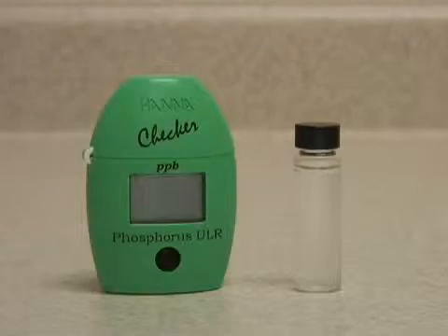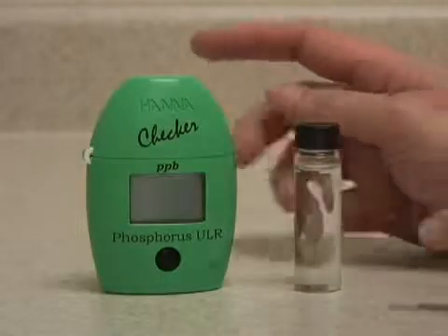This is the Hanna Checker Ultra Low Range Phosphorus Meter. This meter has single push button operation.